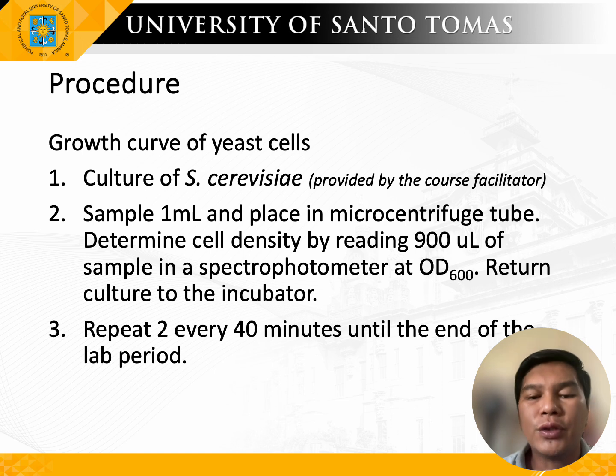And you are going to do it every after 40 minutes until the end of the laboratory period, which means that you do the spectrophotometry and then put it in the incubator, get it, do the spectrophotometry, put it back in the incubator, and do again the activity until the end of the laboratory period.